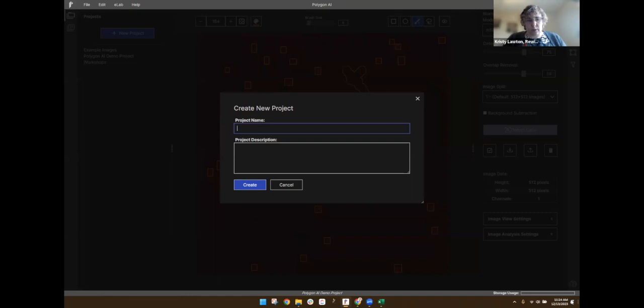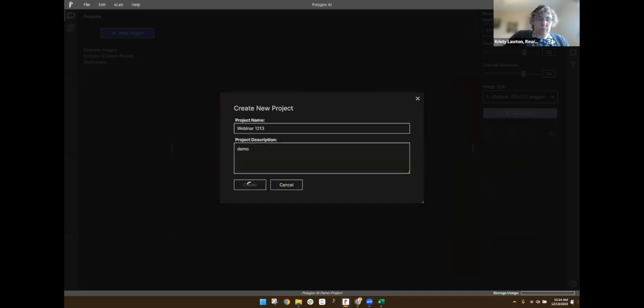So I'm just gonna say webinar 1213 for now, but you can add in a project description very easily with details, much like you would in an electronic lab notebook. So you can keep track of different projects. But you can go back and edit this later. You don't have to set the project description up now, and you can change the name later as needed.